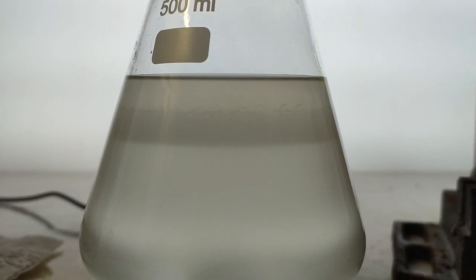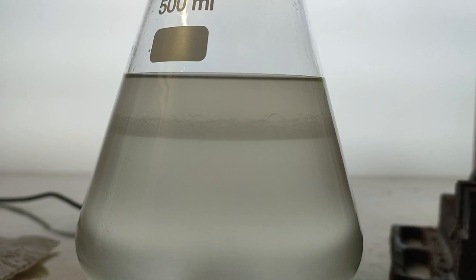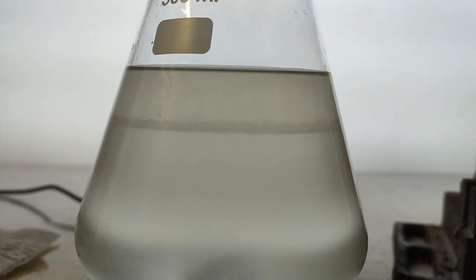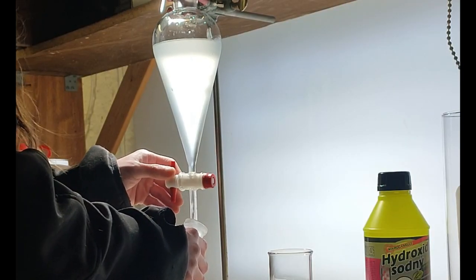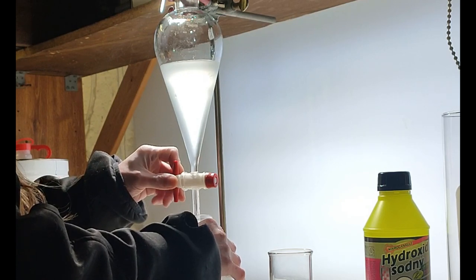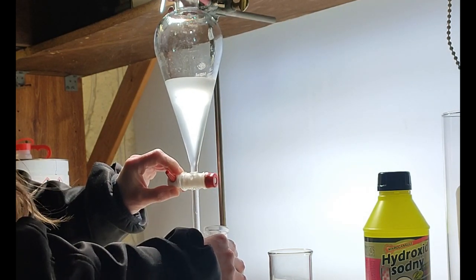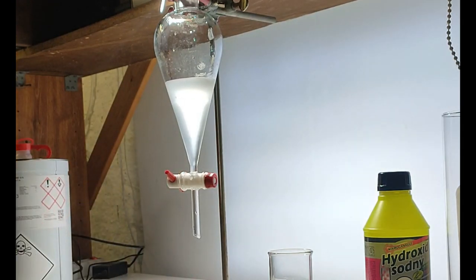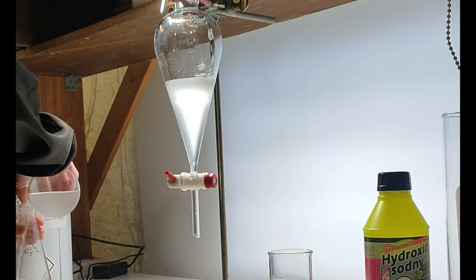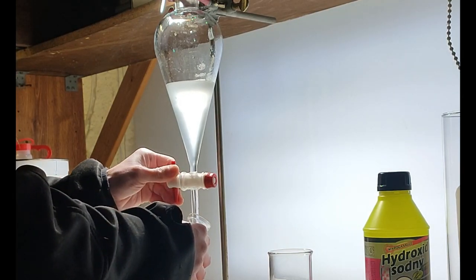Yeah, you know what? I don't think I will bother with DCM extraction. This is nice. This is just nice. Okay, so off into separatory funnel it goes. Okay, so this is aqueous fraction. So let me get it out. Dude, what the fuck? Well, this did not go as expected. Okay, back in this container it goes. Let's continue.